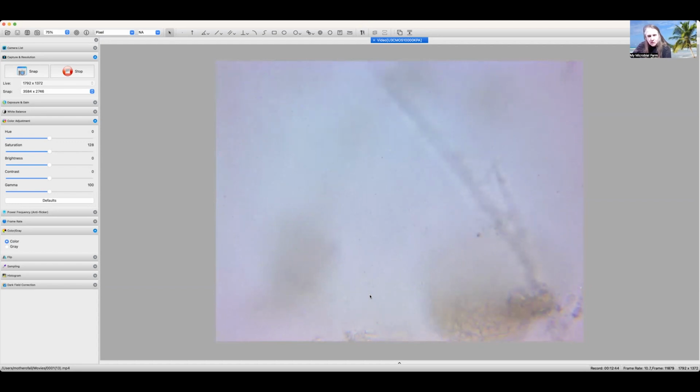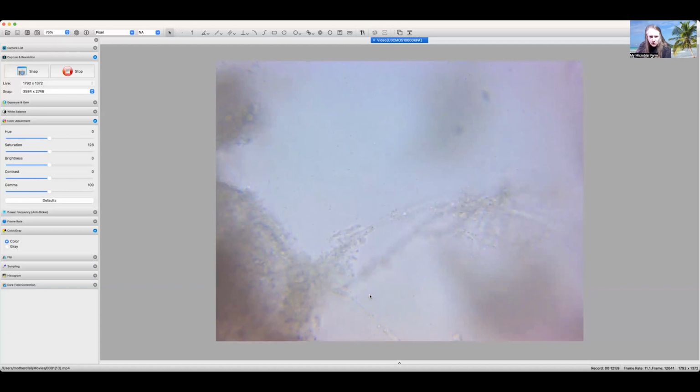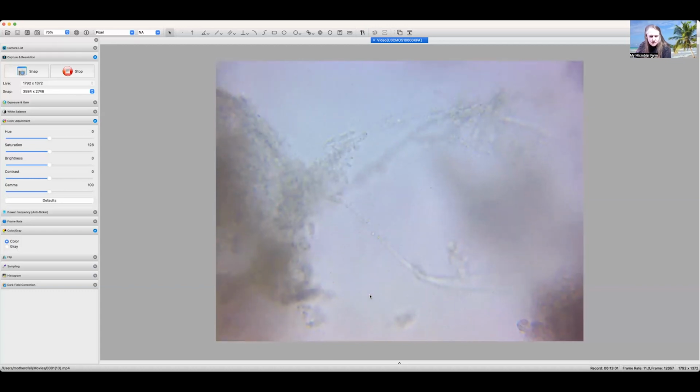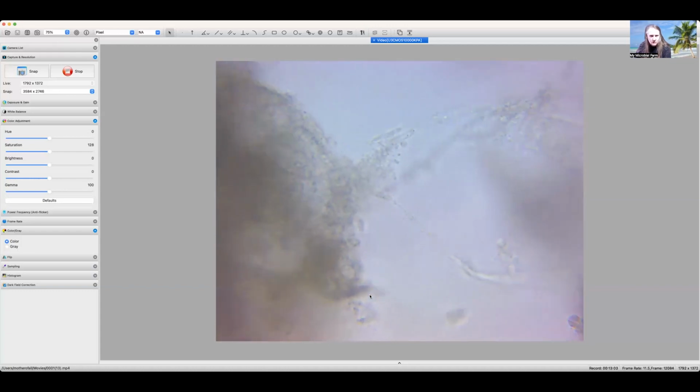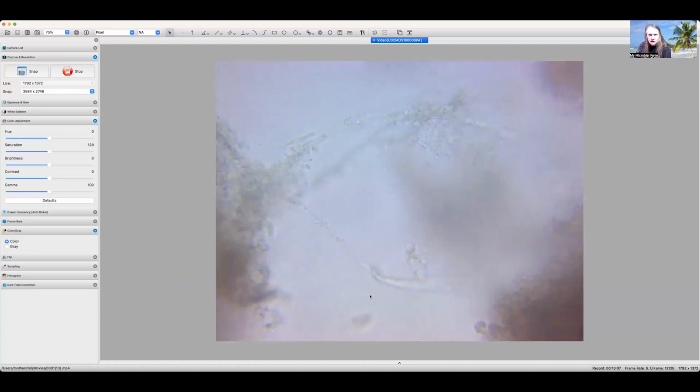So I didn't know if these fungal hyphae are just directing all of these. Okay, that one's broke off and there is no septa. Are they directing these bacteria to do all of this organizing into a structure so they can form some symbiotic relationship there? I'm not sure, but it's super cool once you zoom in on all this.